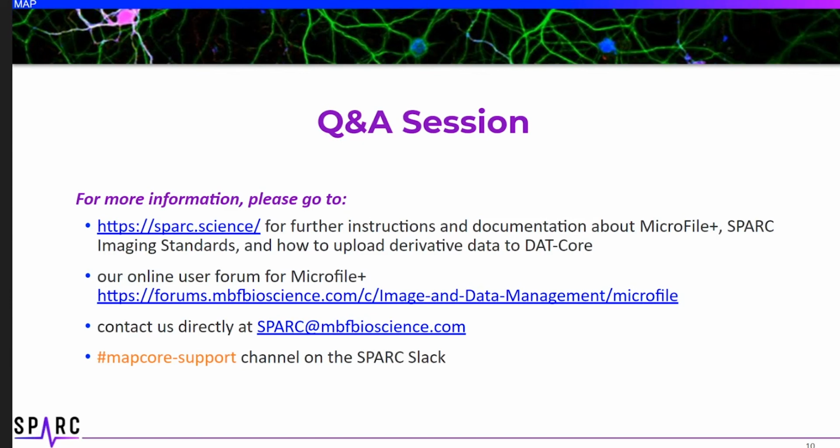What we've seen from curating thousands upon thousands of images is that those two components, what individual channel labels are and what the microns per pixel or the size of the voxels are, are both really important. And so when you use Fiji or ImageJ, you want to make sure that you have the ability to update that information so that the image travels with that important metadata from place to place and person to person.